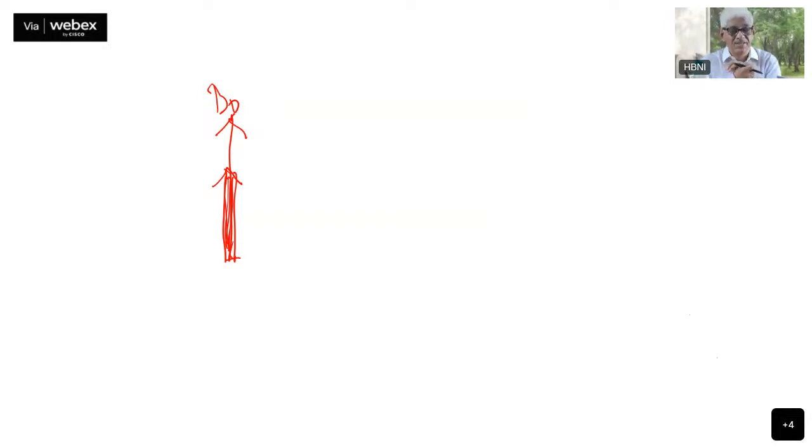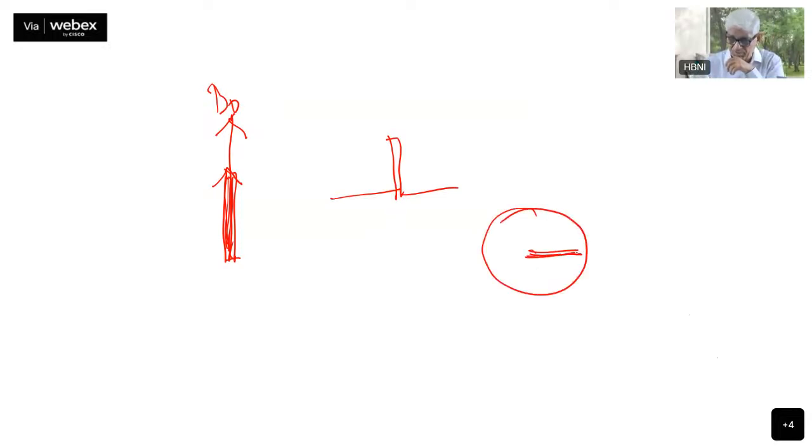Now what I want to do is lock the magnetization in the transverse plane, along the x-axis or the y-axis. So how do I do it? First I apply a 90-degree pulse. When I apply the 90-degree pulse, the magnetization comes into the transverse plane here, and all the magnetization has been rotated here. Of course they have different frequencies. When I remove the pulse, they will all start precessing during the t1 period. They will get frequency labels.